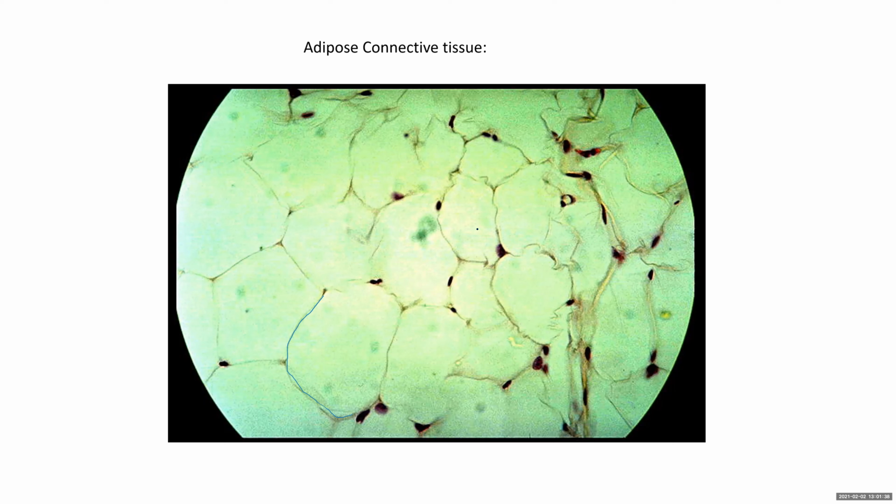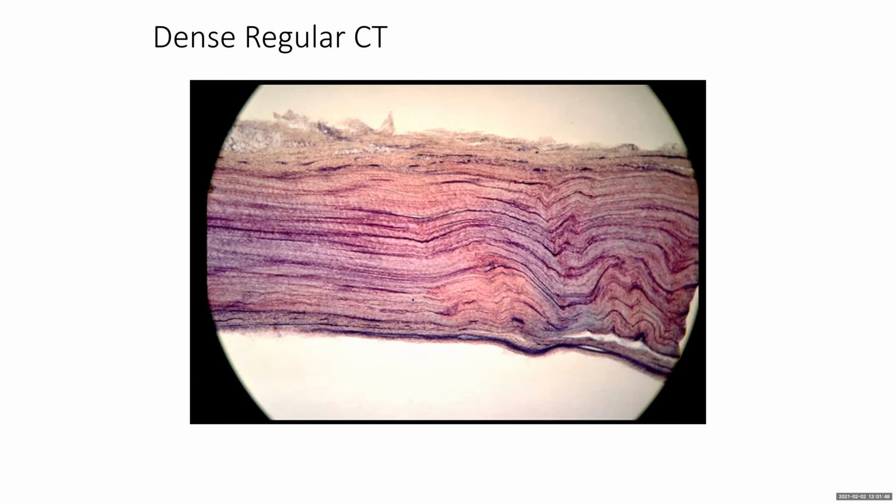Okay, got that? Next one we have here, dense connective tissue. Okay, so this is a pretty nice sample of dense connective tissue.